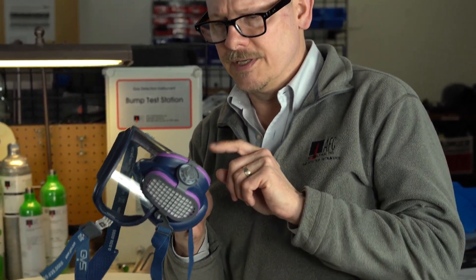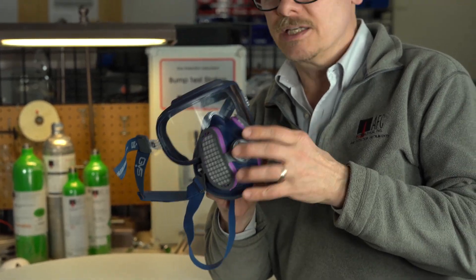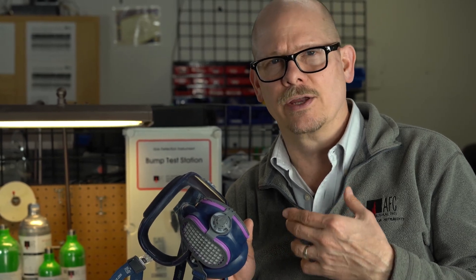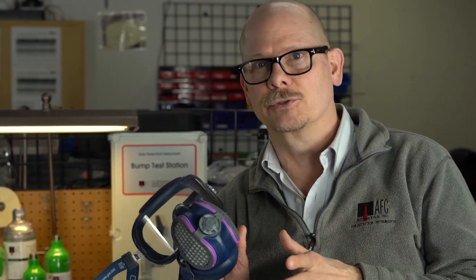The Integra is a half-face respirator mask with integral goggles, safety glasses — Z87 impact resistant goggles — made by the GVS company. GVS is pretty much well known for making filters for many other companies and their masks for respiratory protection, for air purifying respirators. They also make high efficiency HEPA filters for vacuums and HVAC, so they're in the filtering business.